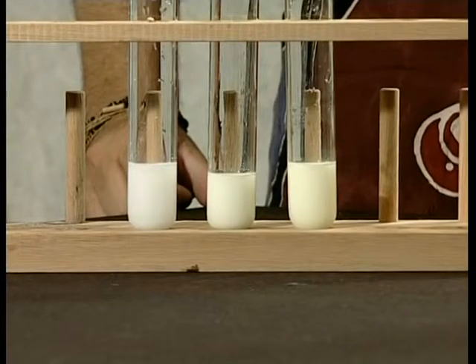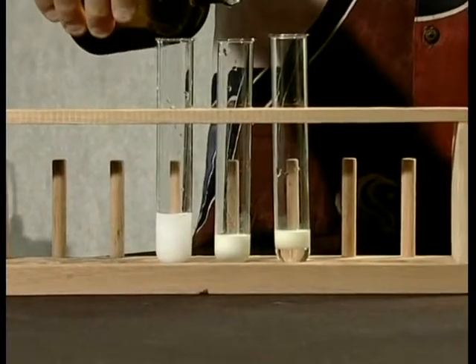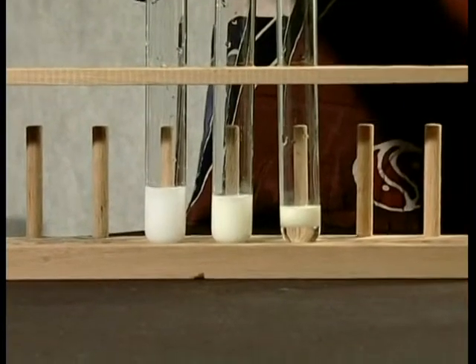In each case, a discoloration was observed. This was due to the formation of a precipitate. Can you see how the color of each precipitate varies? The precipitate did not react when nitric acid was added. That is to say that the precipitate is insoluble in acid.